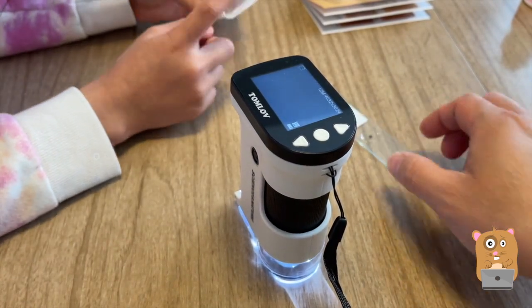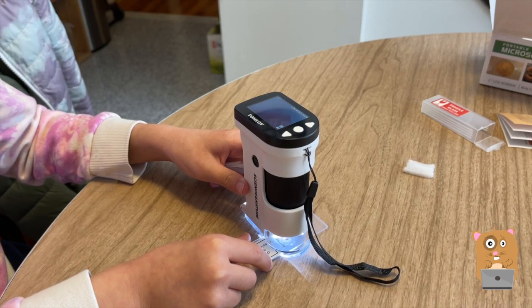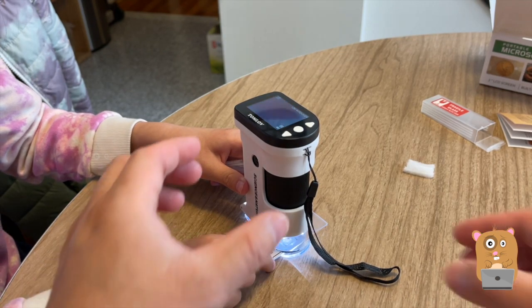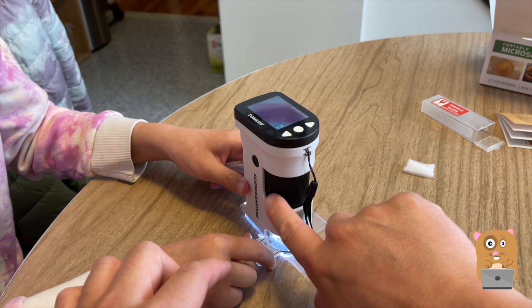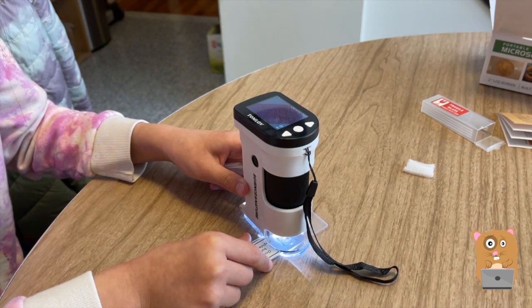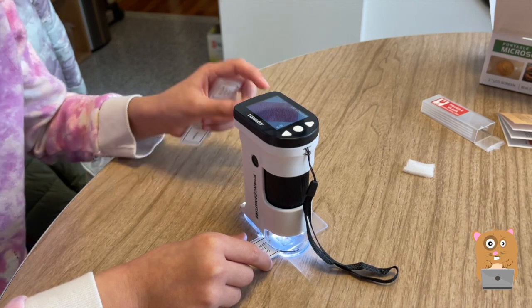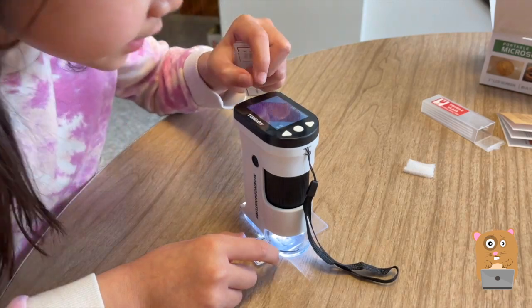Look, Catherine went and got some slides from her other microscope kit. You see this style right here — this is the focus. What is this? It's an onion bulb. There's a little green on it, right there.